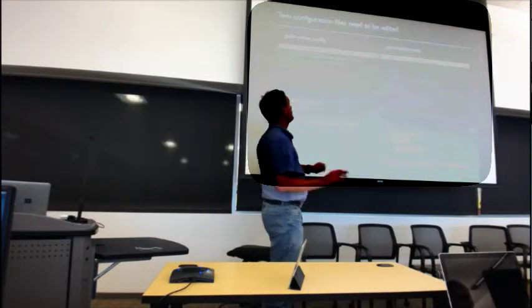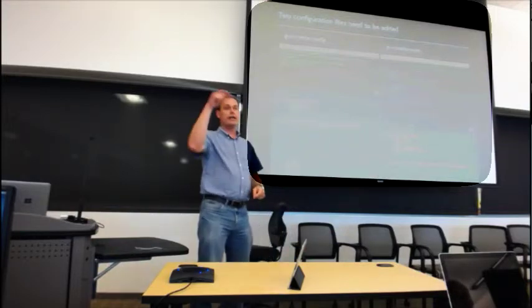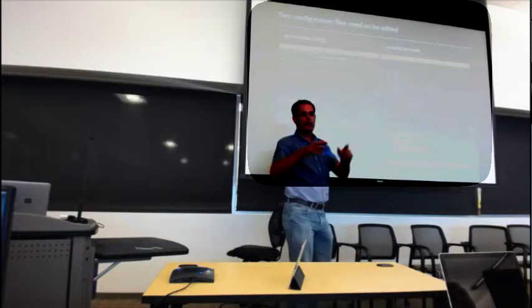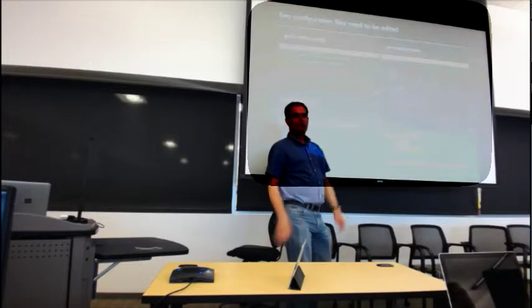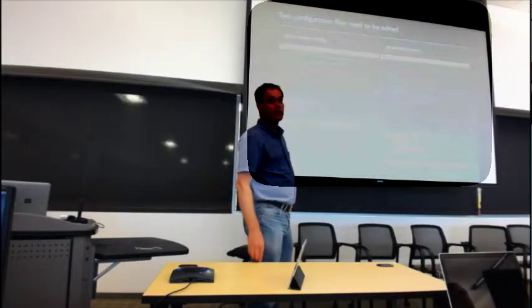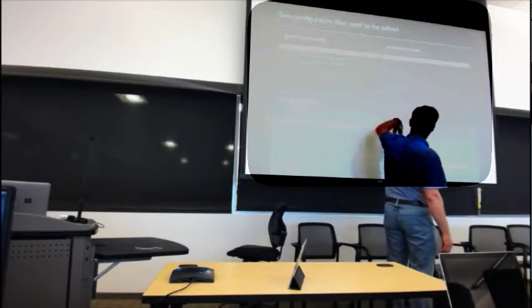Everyone's looking at the same data, so that doesn't have to change. But your HDF5 directory, which is where you want to put the output of Cheetah, you're going to have to add in here: experiment number, scratch, your username, cheetah, hdf5. So you need to tell it where you add that one layer of where the data is located. Okay? And similarly over here, this is in the process script.